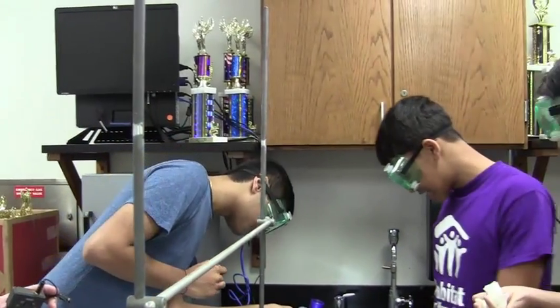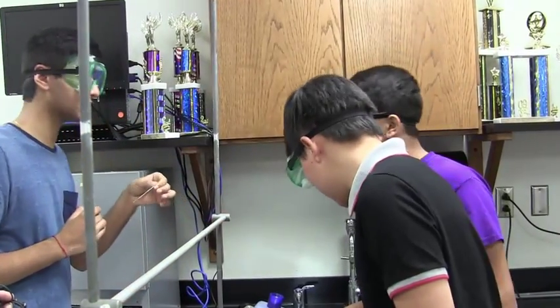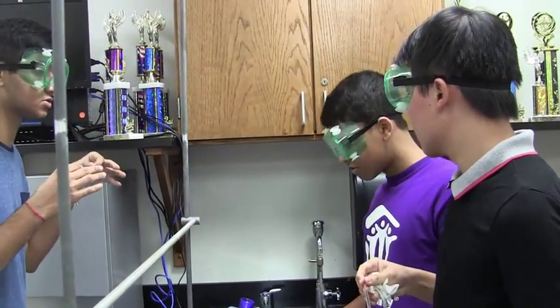Because there's a melting point range. Yeah, there should be. He's right. There's a melting point range, right? So like 5 degrees.